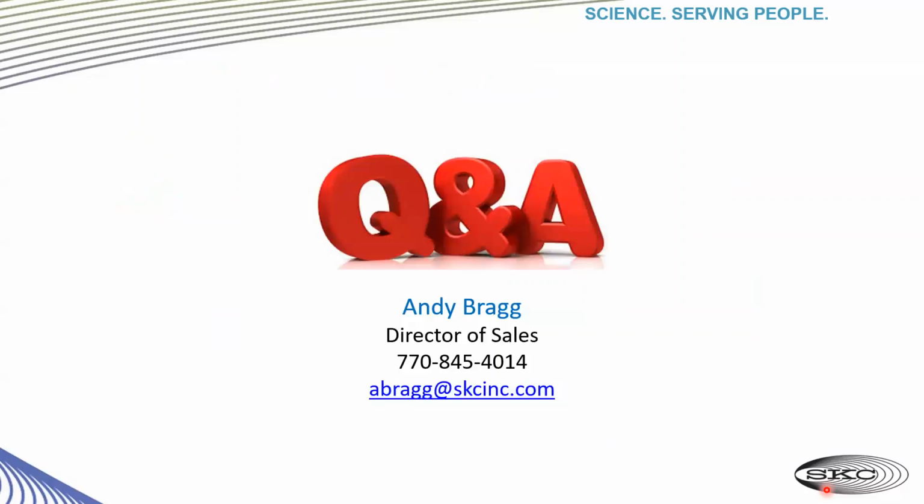I have asked a couple of very qualified panelists to help answer your questions. Saulius Trachimus is not only an aerosol physicist, and not only our product development and engineering team leader, he also is the inventor and subject matter expert on the PPI. So I'm very grateful that he is here to answer any of your questions.